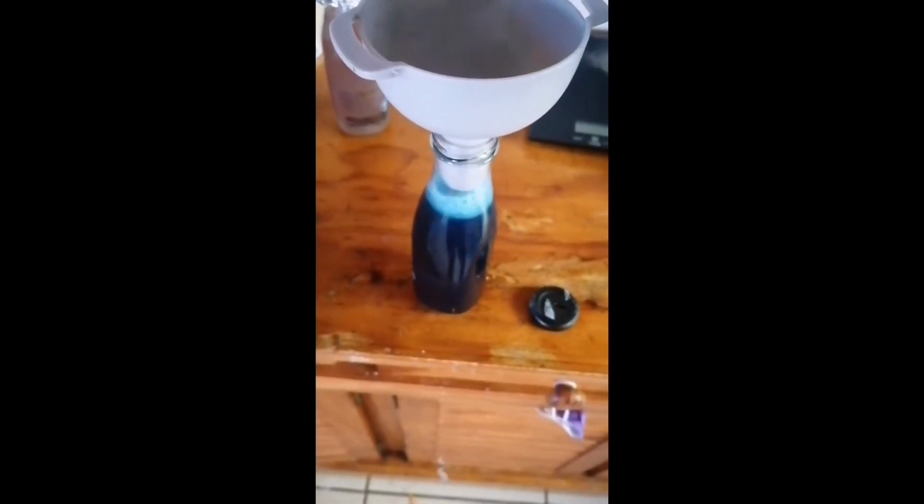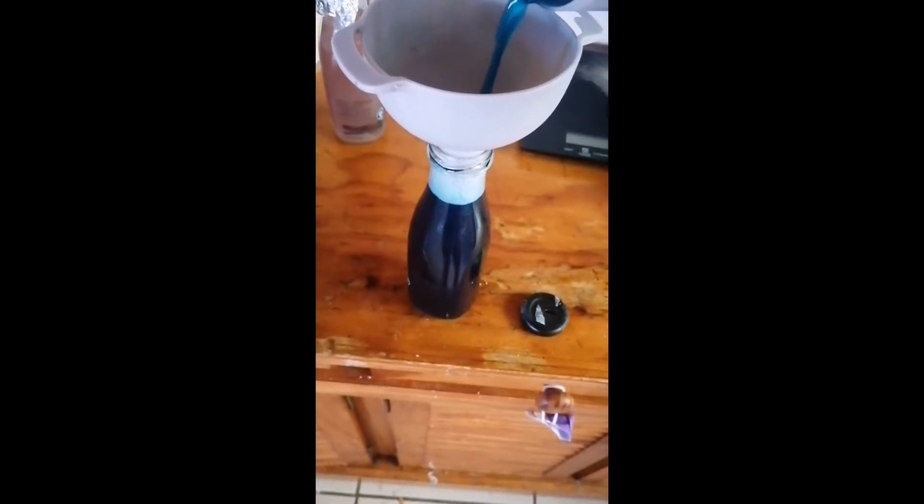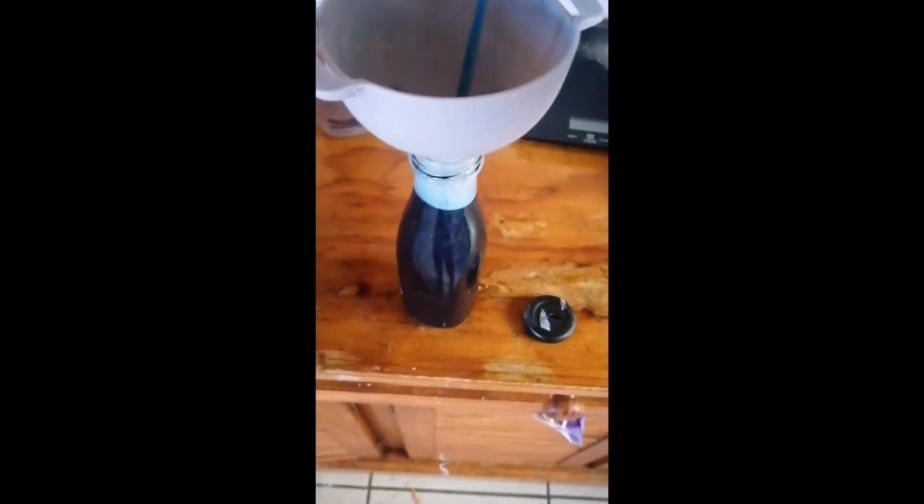Use a funnel. It makes everything so much easier. As you can see, we get that beautiful blue liquid that reminds us of psilocybin. So I'm just filling it up. I did mess a bit, but it doesn't matter. Everything that is dirty can be cleaned again.